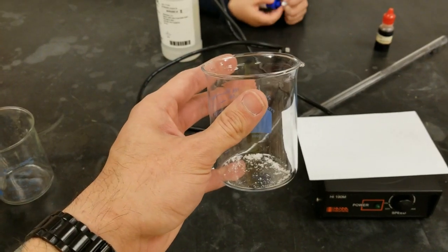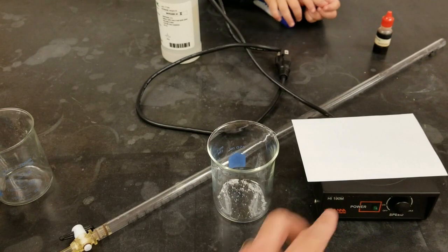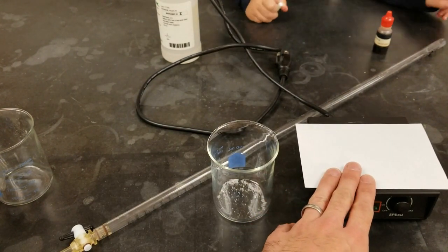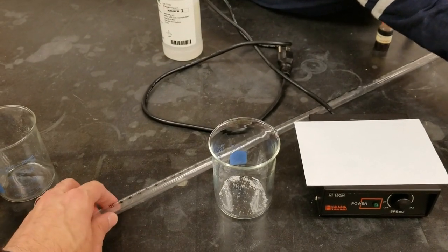We've got our oxalic acid powder here. I'm going to be adding some distilled water, stirring it on the stir plate and conditioning the burette with the sodium hydroxide as that is mixing.